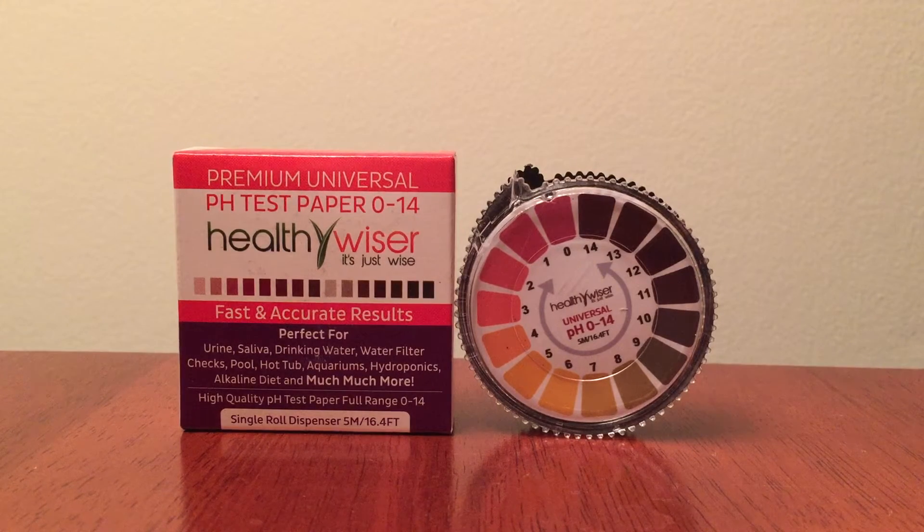Everyone should have these strips — not only for your health but to measure all the items above. I'm really very impressed with the Healthy Vicer pH test strips and I would highly recommend it.